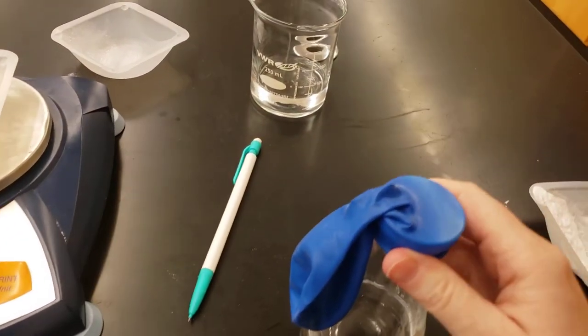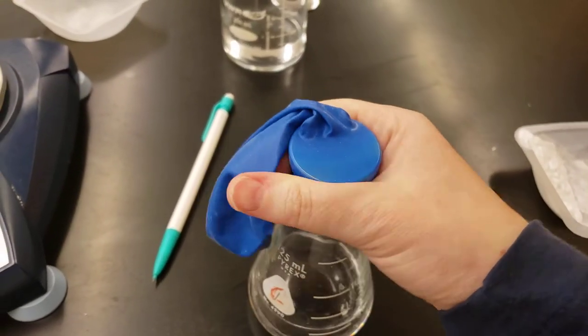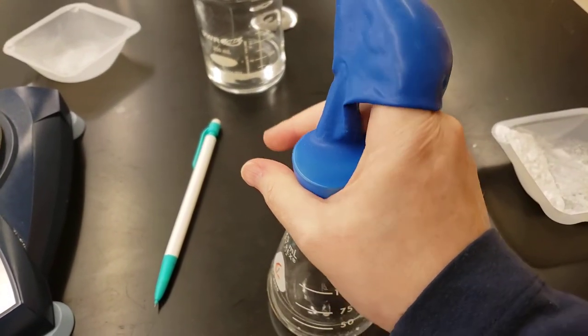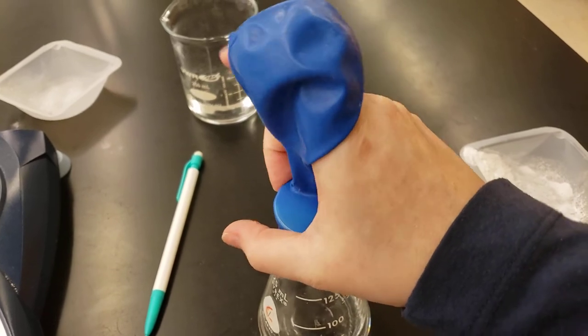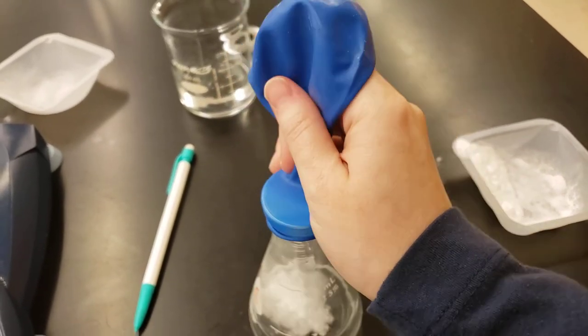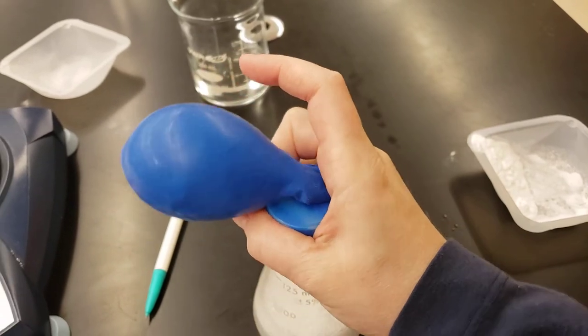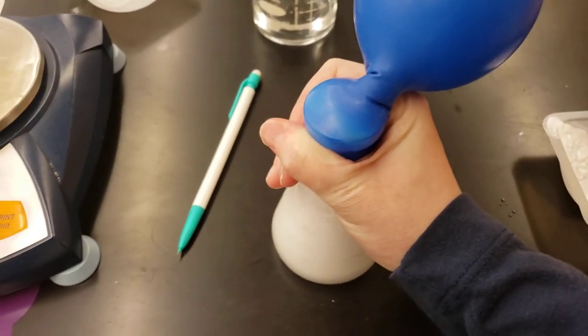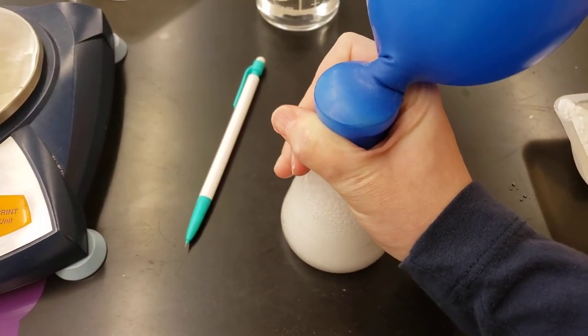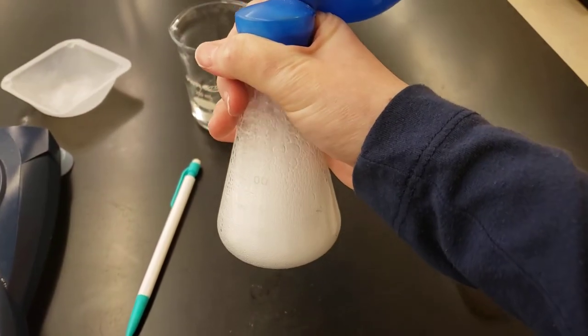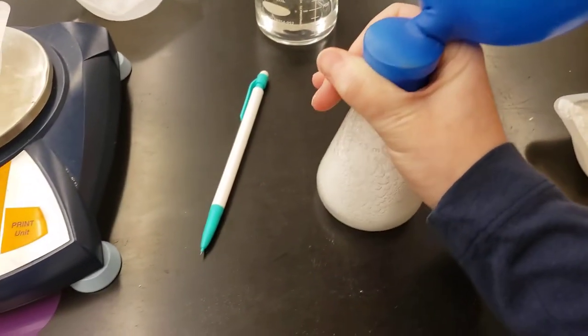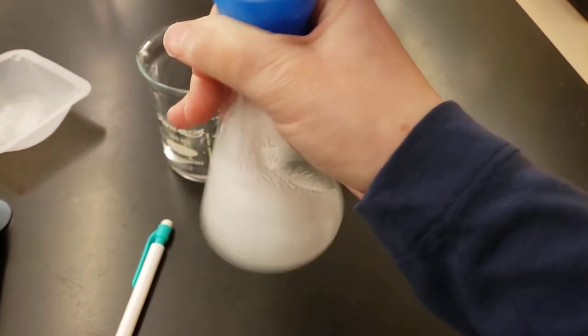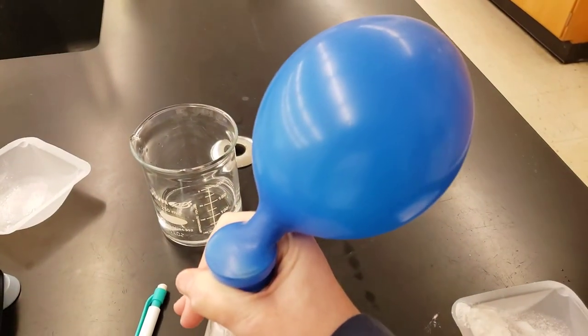The most important thing is to keep a tight grip on the balloon when this happens so that it does not fall off your Erlenmeyer flask. All right so we want to dump our baking soda keeping a hold while our reaction is occurring. You can see our balanced chemical equation. It is allowing carbon dioxide from our reaction to go from our flask into our growing balloon.